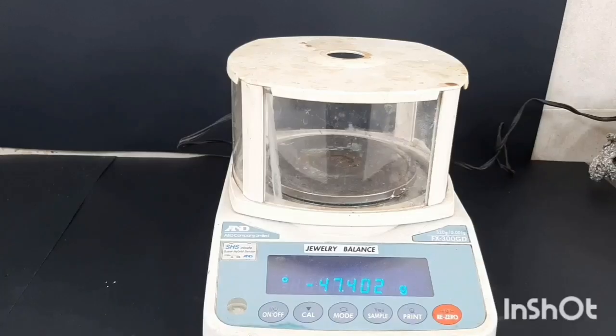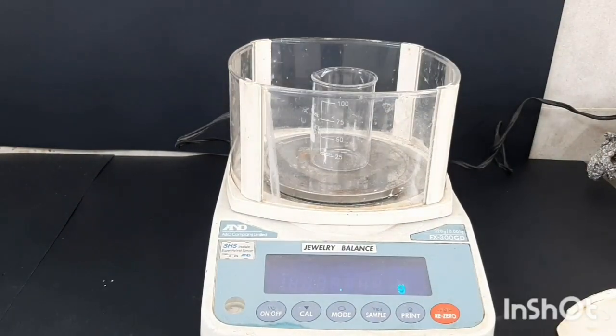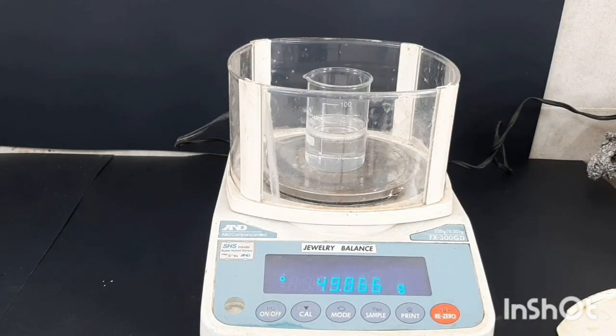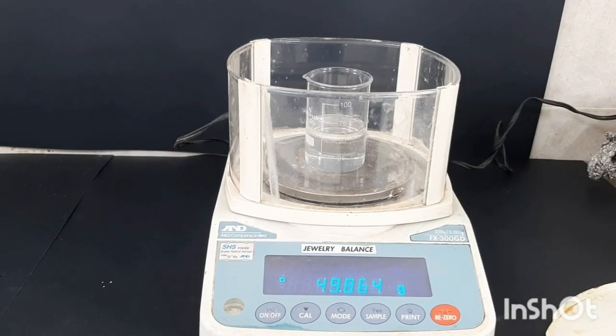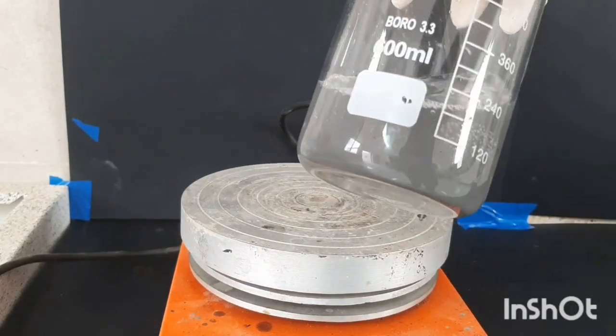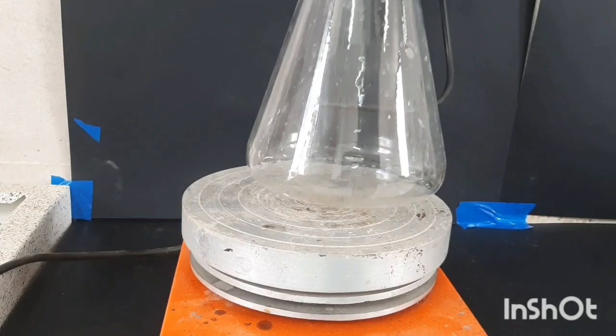Then I put the sample in the fridge and drained everything not frozen below 15 degrees Celsius. Then I checked the density and it matched the 0.96 grams per milliliter, so I consider it quite pure. I'm going to measure 50 grams of cyclohexanol. Cyclohexanol has 100 grams per mole as molecular weight, so 50 grams is half a mole.